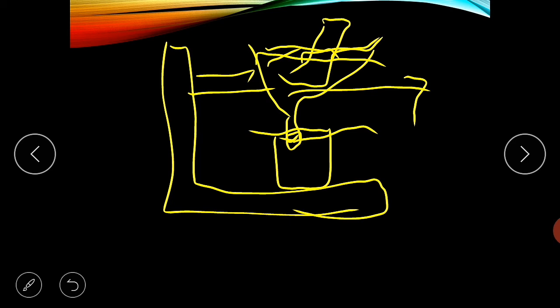Next thing is active and motile nematodes can be collected when they touch the tissue paper with water. Advantages: a clear nematode suspension without debris can be obtained, and the nematodes are collected in a small amount of water.